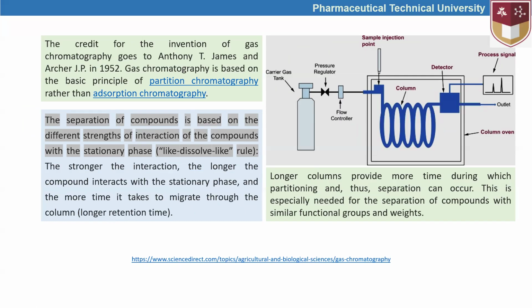Okay, about the affinity, we talked about it in our column chromatography, in general chromatography video lesson. The main power that results in different flowing times of compounds in HPLC or in column chromatography is the interactions between the compounds being separated and the matrix. A similar mechanism is expected here in GC as well, but the difference between gas chromatography and liquid chromatography is that here we use gas as the mobile phase.